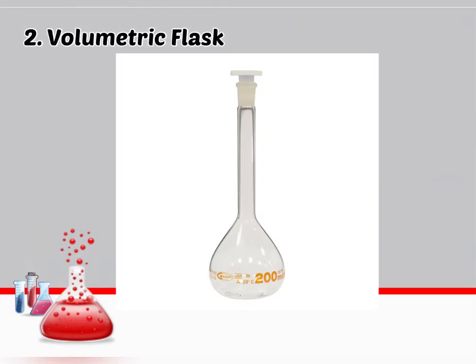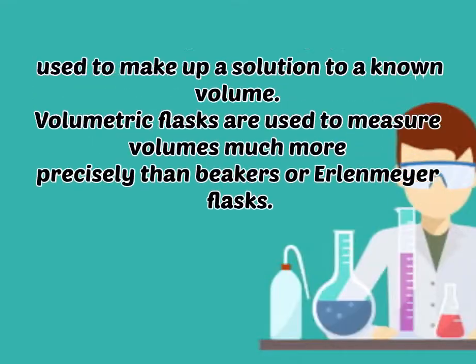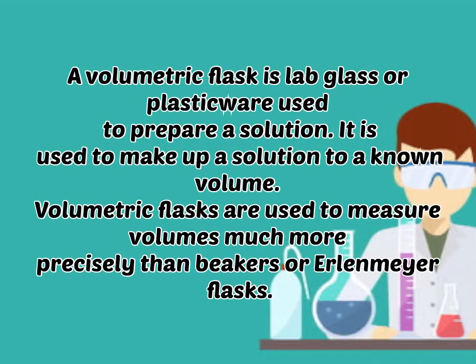Next, we have the volumetric flask. A volumetric flask is a lab glass or plasticware used to prepare a solution. It is used to make up a solution to a known volume. Volumetric flasks are used to measure volumes much more precisely than beakers or Erlenmeyer flasks.